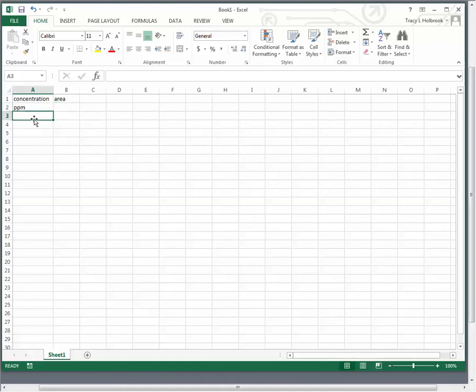All right, so down here below, I can make this as fancy as I want to make it, but I'm not going to trouble with it. Down here at number 4, I can skip a line to kind of clean it up a little bit. I can put my first concentration that I made. And that first concentration was 1.034, so I just type it into Excel and I hit enter, and there it is.